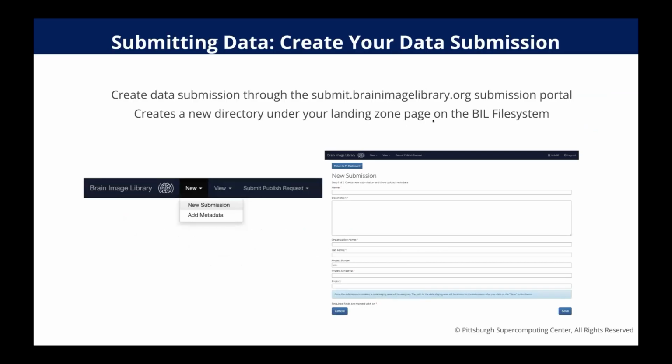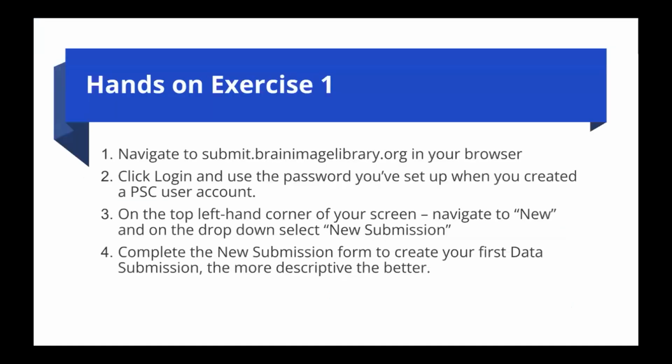So to do that, on the submission website, on the top bar, there's an option for new and new submission. Clicking that will get you to a form to fill out to get that landing zone directory to point your data to. So we'll go ahead and do that.